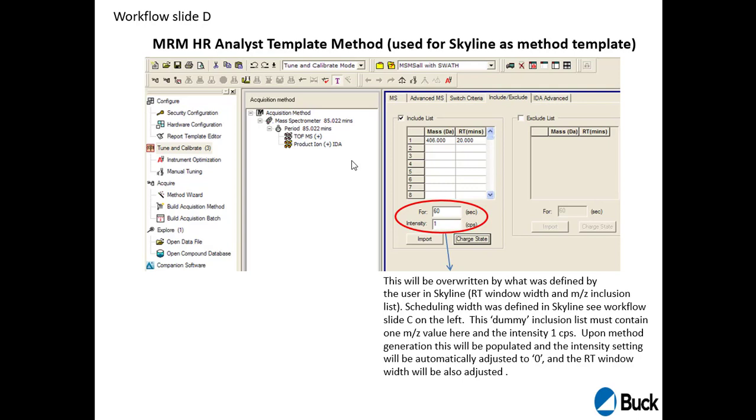And into this inclusion list, Skyline will export the method, the precursor ion numbers, both the precursor ion m/z as well as a retention time column here. This will be the retention time that Skyline had for the measured peptide in the Skyline file. So you really export m/z and retention time into this inclusion list.